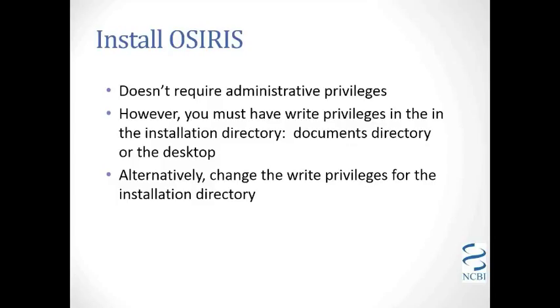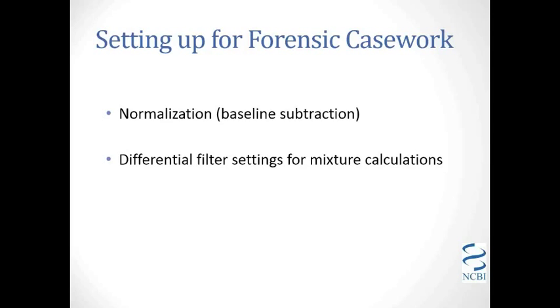So setting up for forensic casework, there are a couple of things that I would suggest strongly. One of them is doing normalization, this is for baseline subtraction, and there's also differential filter settings for mixture calculations. So if you're doing mixture calculations using software, you can set OSIRIS up so that it will treat your reference samples, your knowns, differently from your mixture samples, and will apply filters, or not apply filters, to your mixture samples as you choose.